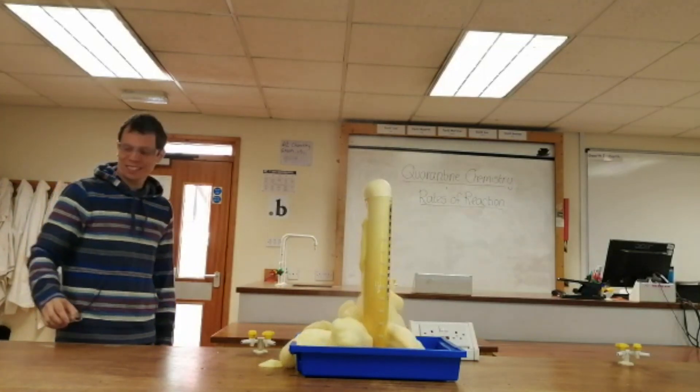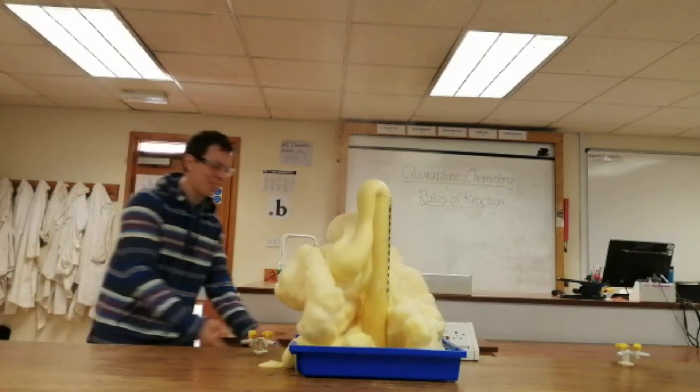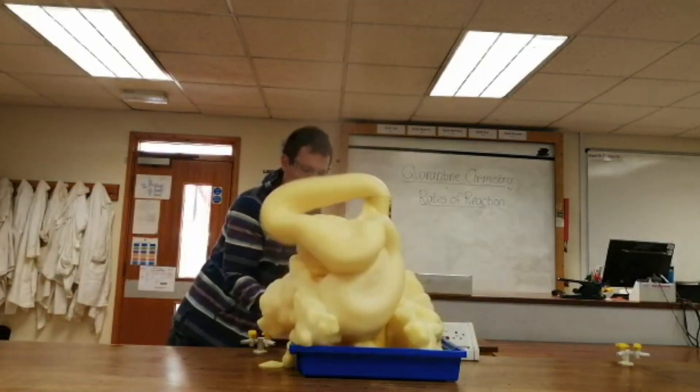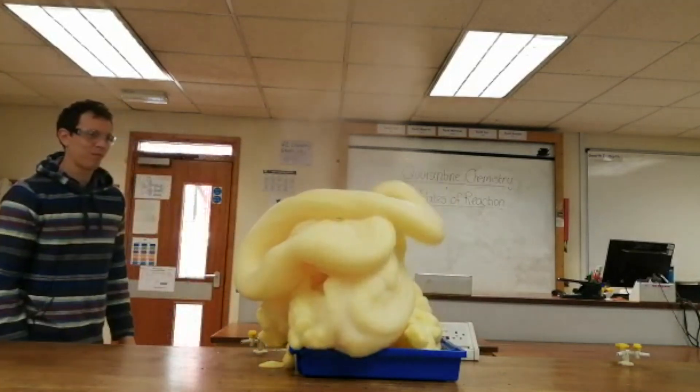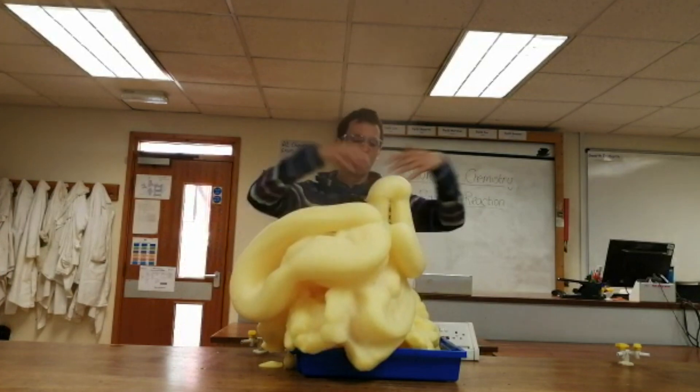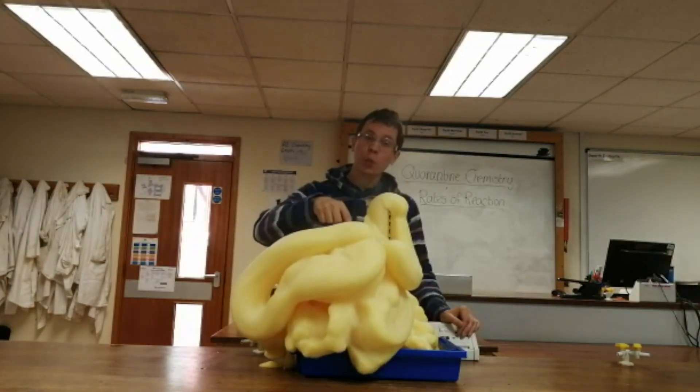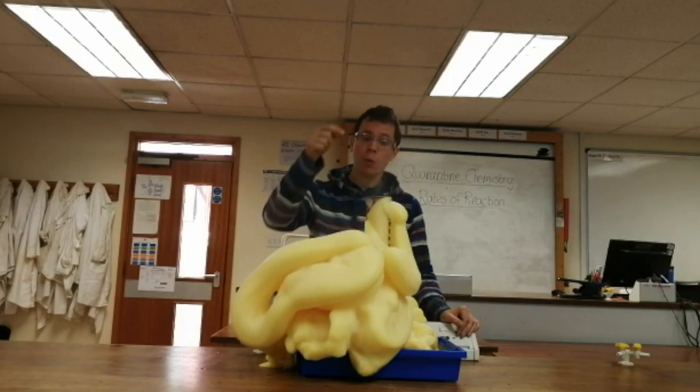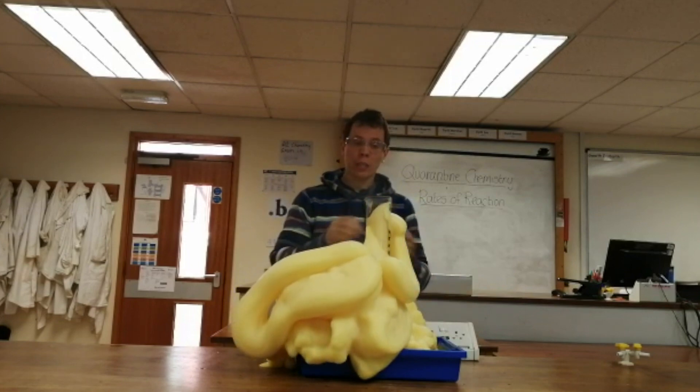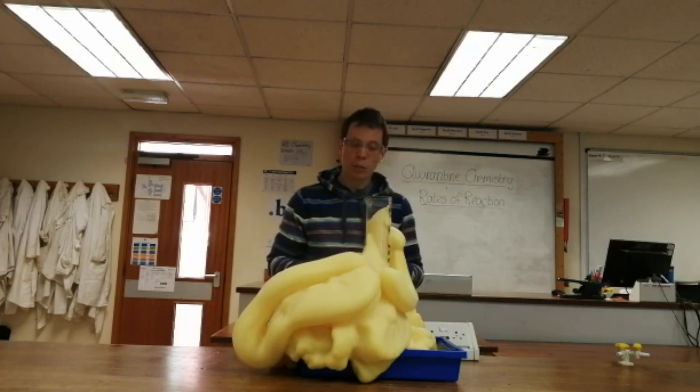I'm so glad I've got the tray there. Okay, so you can see that a whole load of foam has formed. This foam is formed because we've got oxygen gas being produced, and I've put washing up liquid in there. So the washing up liquid is forming bubbles with the oxygen gas. So all of these bubbles contain oxygen.